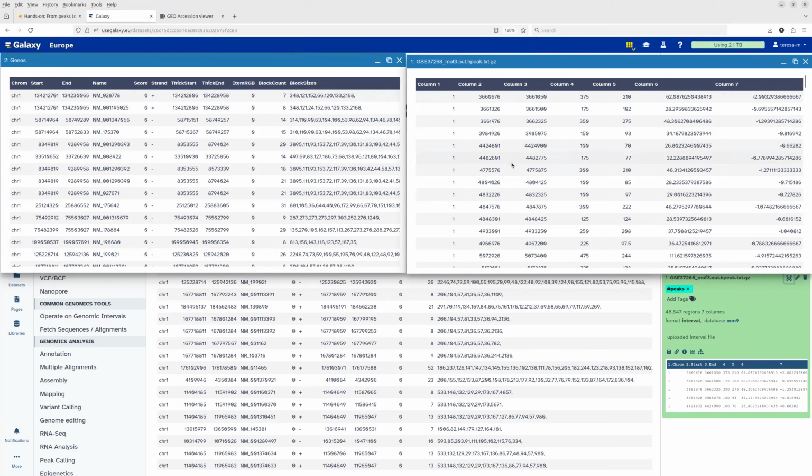However, we don't know how this file is treating the sex chromosomes. So we already know this distinction that the chr is missing in the interval file, but we know from UCSC it will specify the sex chromosomes as X and Y, but we don't know how it looks for this output file.